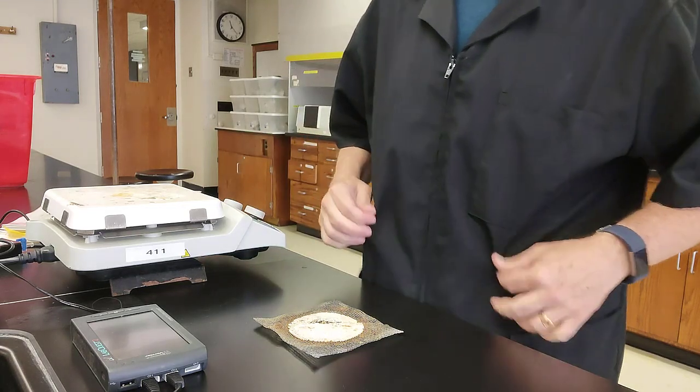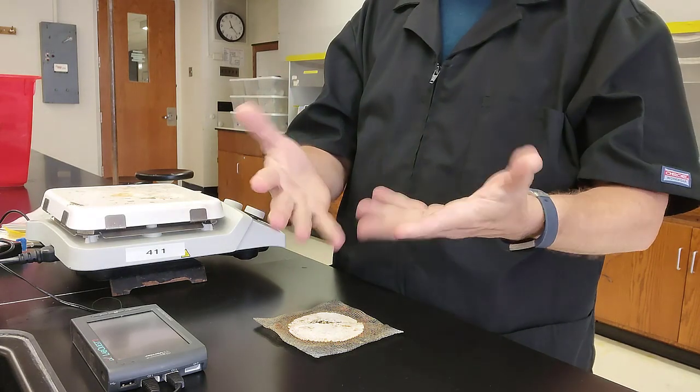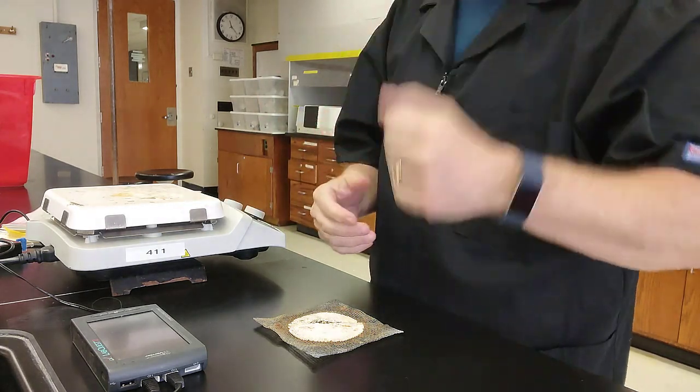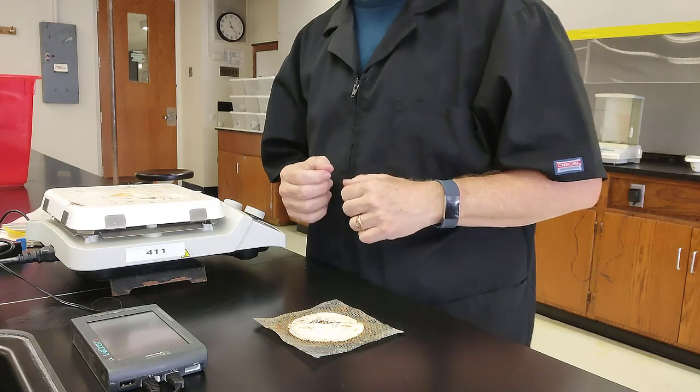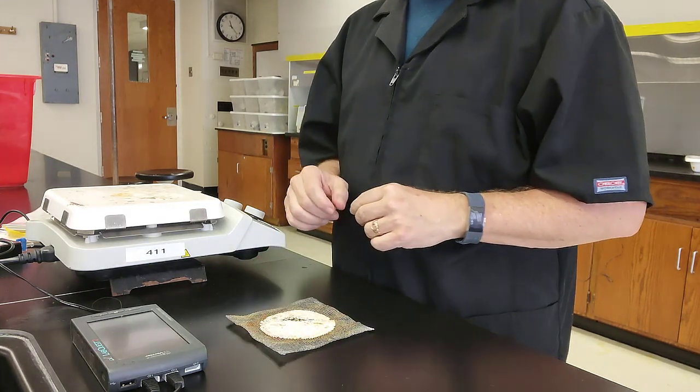As always, I've got my lab coat on, I've got my safety goggles on, and I'm choosing not to wear gloves, but that's an educated choice on my part. You can absolutely make your own educated choice about whether you would like to wear gloves or not for this experiment.